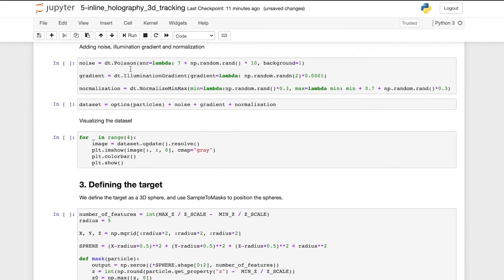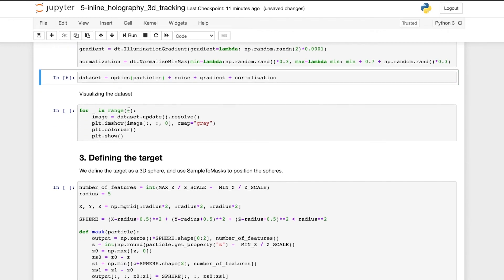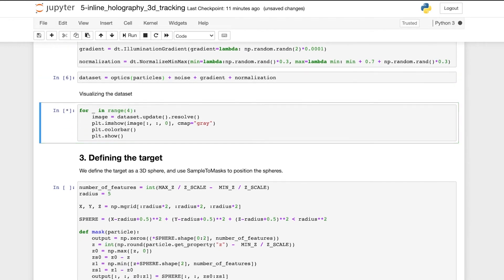We then add noise and illumination gradient to the images before normalizing them. And now we can visualize the training images.